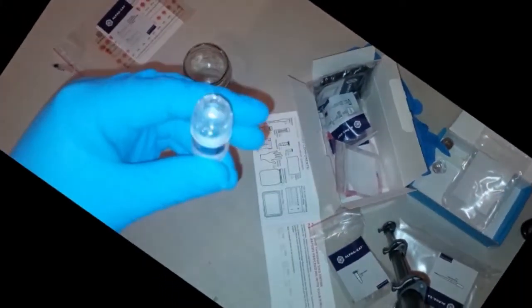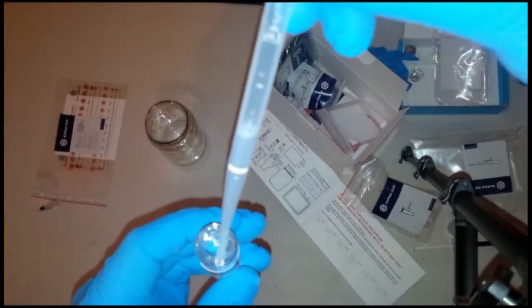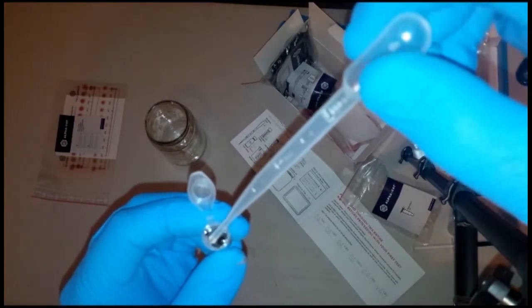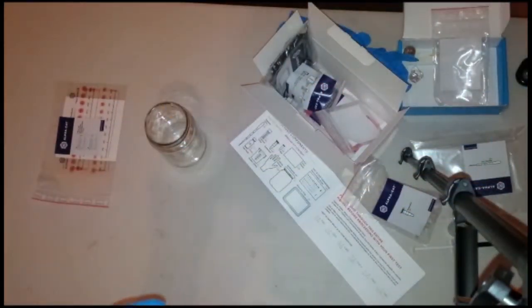The next stage is to use the supplied pipette and take exactly 1 milliliter and add it to the Eppendorf or extraction tube. When that is done, make sure the lid is sealed and shake vigorously for 10 seconds. It is important that the RSO is well shaken, and before doing this, ensure you close the lid on the extraction fluid as it will evaporate.